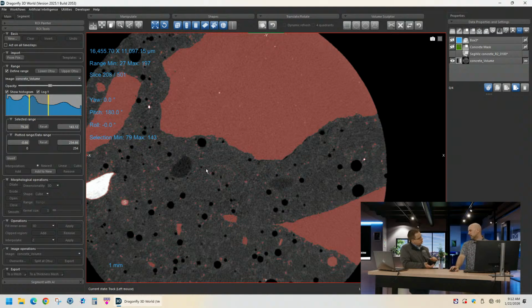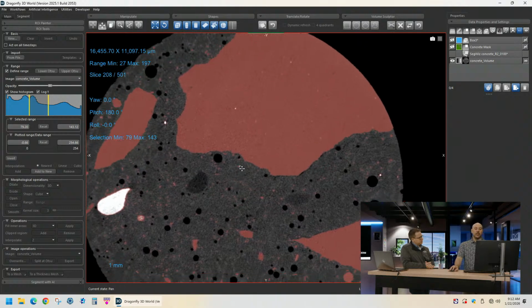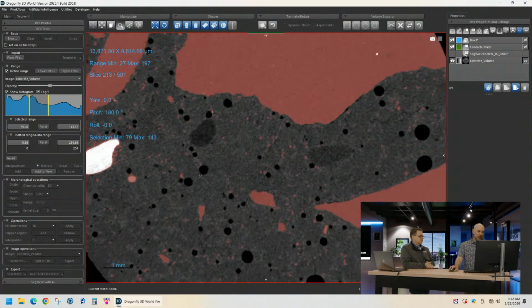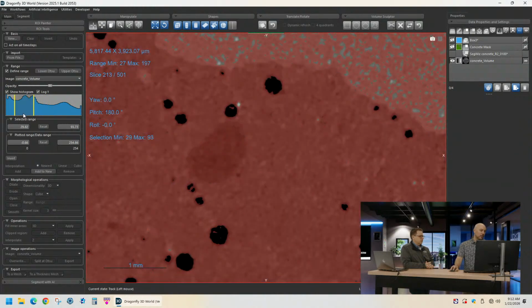Yeah. That could be there, but it could also be noise, right? Right. And this is one of the problems. This is a much easier example. But for example, let's look at some of these darker spots. What if we just want to identify that?